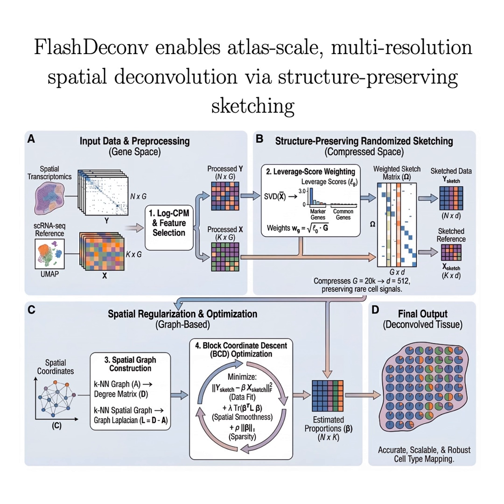But once you start using those coarser bins and you start mixing these physically separated cells, they get artificially bundled into the same measurement. And this created a mathematically induced positive correlation that peaked at 64 microns resolution. The signal literally flipped signs. It did. So if you had only analyzed that 64 micron data, you would have wrongly concluded that these two cell types are close collaborators, when in reality they are mutually exclusive. The coarse resolution lied to you.